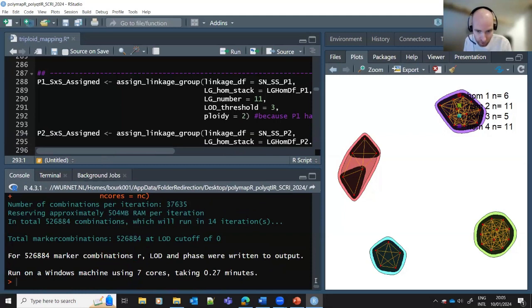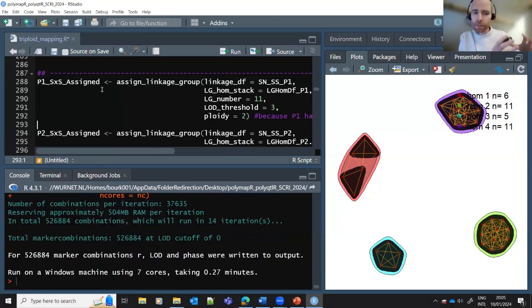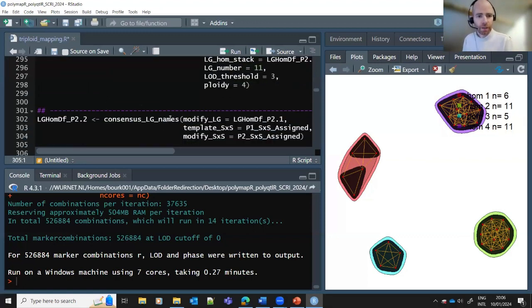Okay, so this is run the linkage. Let's see, did I do it for both parents there? Yes. Okay, so what I've done is I've calculated the linkage between the simplex nulliplex markers in parent 1 with these cross-parental, these biparental markers. I've done the same thing in parent 2. And then we just use this function to check that the linkage names are consistent. So we go for consensus namings, and we supply what we've just figured out, these linkage estimates between these cross-parental, these biparental markers.